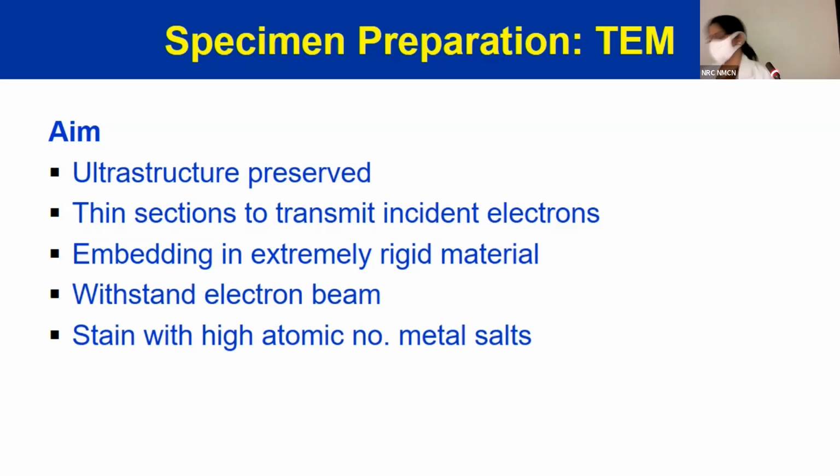Okay, so the basic sense is that it keeps the ultrastructure preserved, right? But when you take it in glutaraldehyde, we keep the tissue in the refrigerator, as compared to light microscopy where we never keep the tissue in the refrigerator. We have to keep it at room temperature. Why? Because the penetration power of glutaraldehyde is very low. So if you keep it outside, the tissue will get autolyzed. That is why we take it in glutaraldehyde, and if you do not send it to the lab immediately, you are asked to keep it in the door of the fridge.